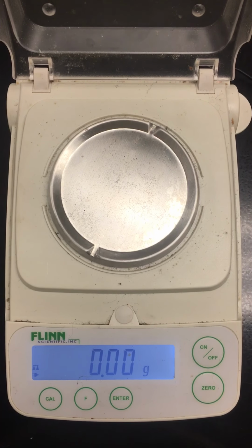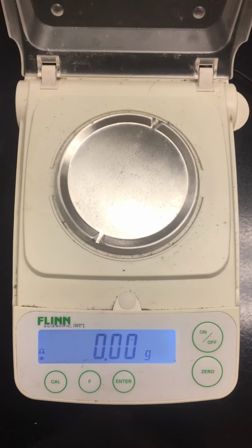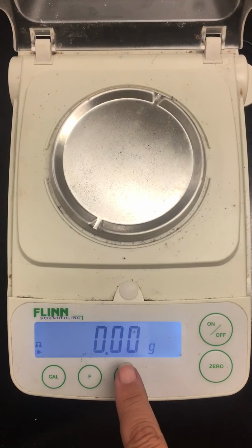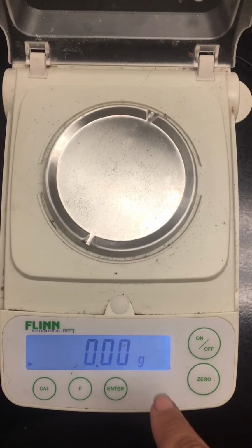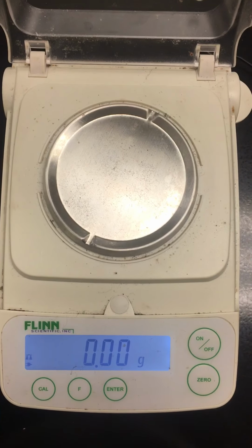For this lab, we are going to be counting atoms by weighing, and the first thing we need to understand is how to read the scale. Notice the scale goes to the hundredths, so all your measurements should be recorded to the hundredths because that's the precision of this instrument. Remember, we talked about the last value being an estimate. Well, as you can see, if I wave some air over here, it changes that scale. It's very sensitive, so that last hundredth is an estimate.